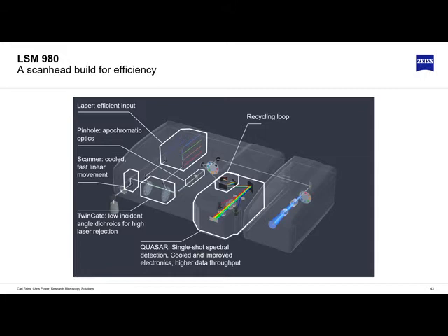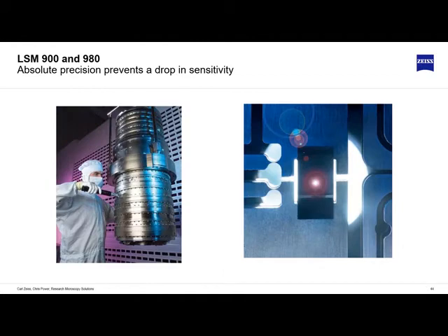So the pinhole, we kind of think it's a bit boring at times because from 1984, it's a hole. The pinhole on the 9 series actually came as a spin-off from one of our sister divisions. Microscopy is actually only about 10% of Zeiss. We have other divisions making other things, you know, optics, consumer optics, cinema lenses. And one of our biggest divisions is lithography, where we make these massive multi-million euro lenses you see on the left here for wavelengths down to 13 nanometers. And yeah, you think microscopy is precise, these things have to be extremely precise.